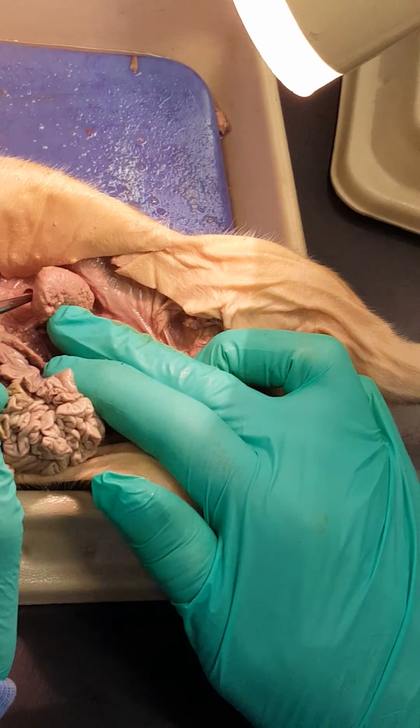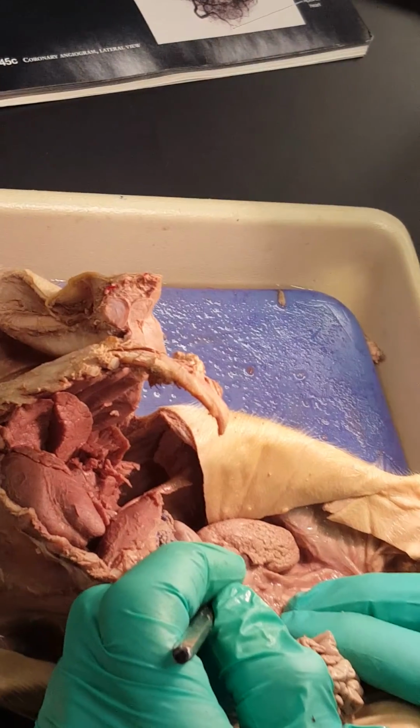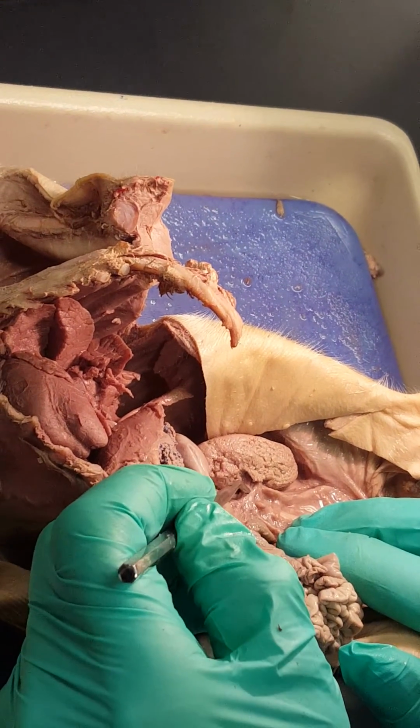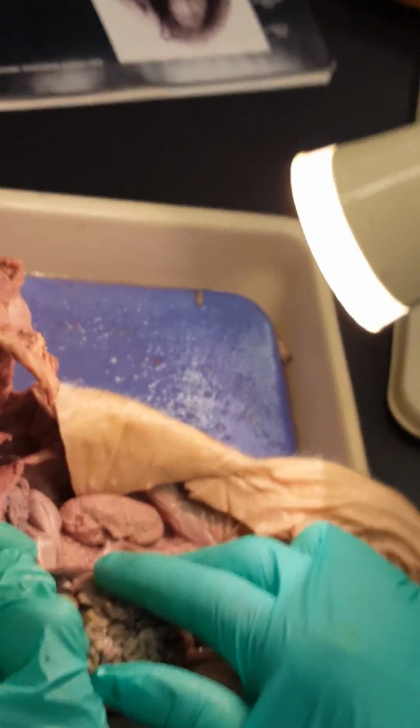Kidneys. The kidneys. Okay. So we call that the renal artery. And it sits right beside a renal vein. The renal vein is going to have to cross over the dorsal aorta to get into the inferior vena cava, which is just always on the right side of the dorsal aorta. Okay.